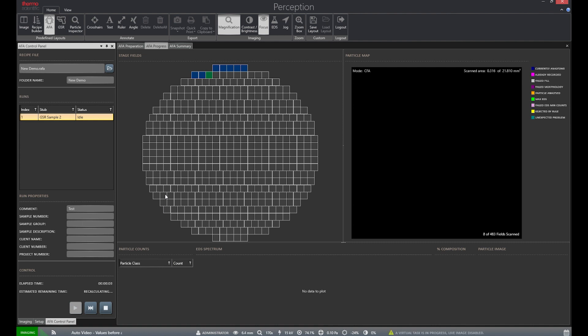The software will move to the auto video sample to adjust contrast and brightness, degauss the system, and then move field by field in the first area, searching for particles.